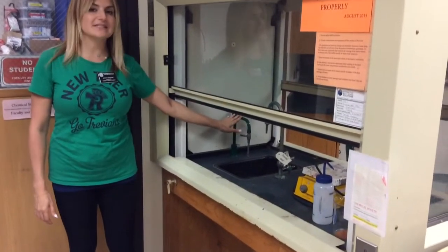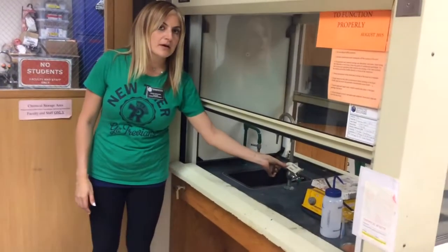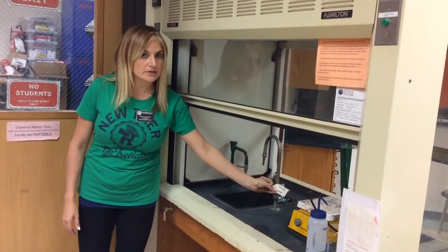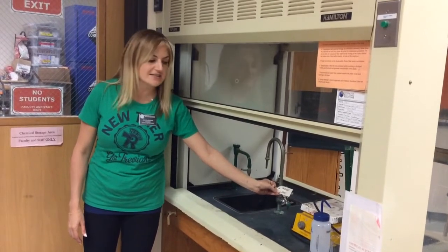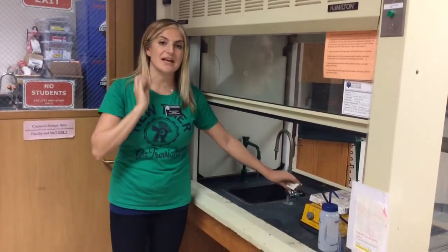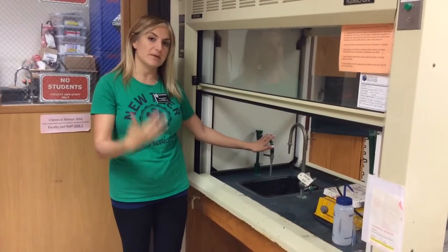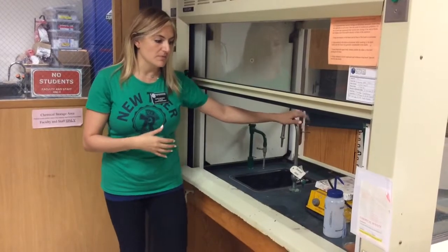This is regular city tap water, and on the right here is a label, and it says Deionized Water. Deionized water is purified water. The ions in the water and the impurities have been removed, so it's a very pure form of water. A lot of times in lab we use deionized water, not to be confused with your tap water that has ions and impurities in it. A lot of times our reactions need those impurities to be removed.